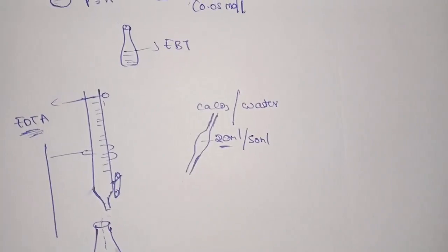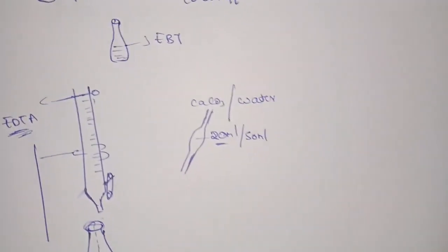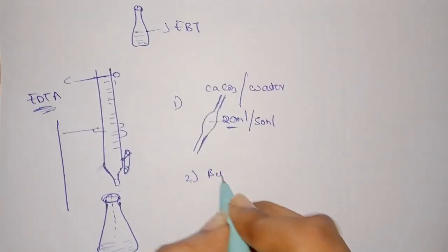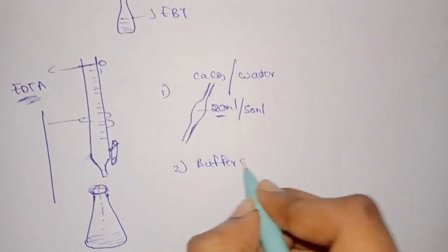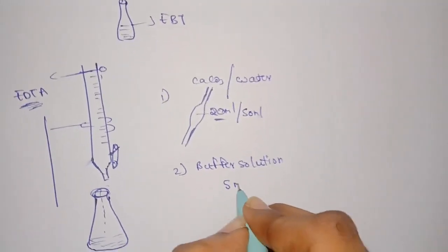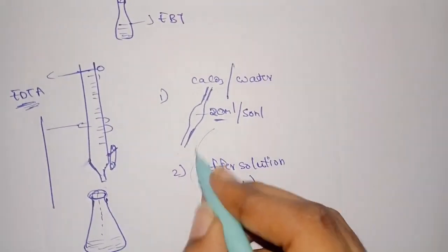Then we add the buffer solution, 5 ml for the 20 ml.